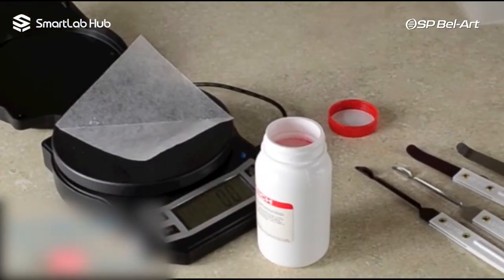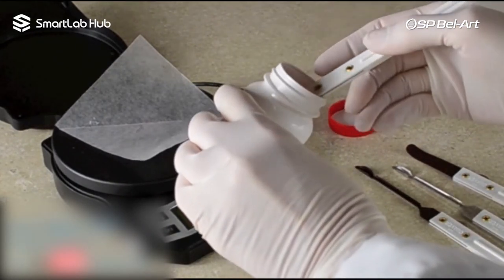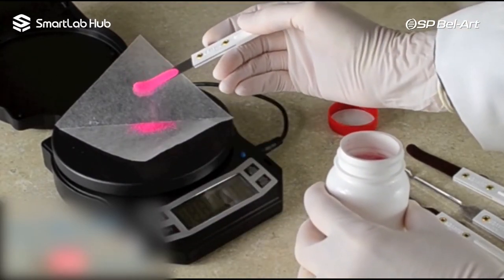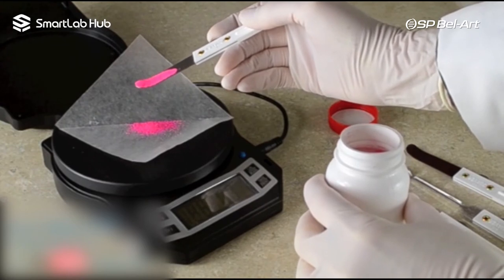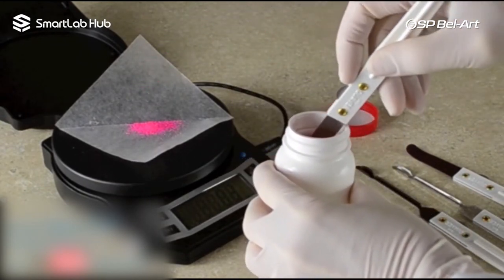Quaver and Quaverette microblade vibrating spatulas make additions of minuscule amounts of material simple, controlled, and accurate. Rotating the tooth thumb wheel on the side of the Quaver vibrates the spatula slightly, giving you control over transfer from spatula to weighing dish.